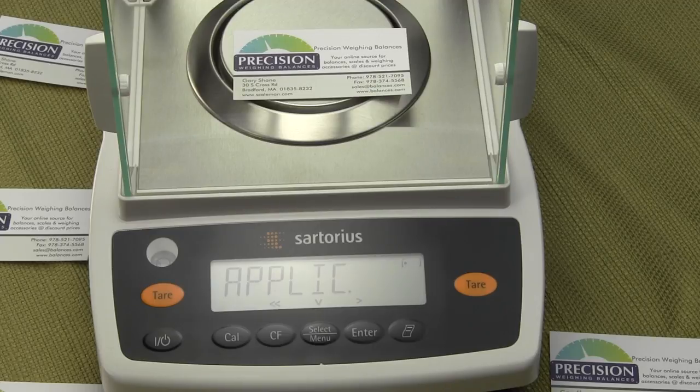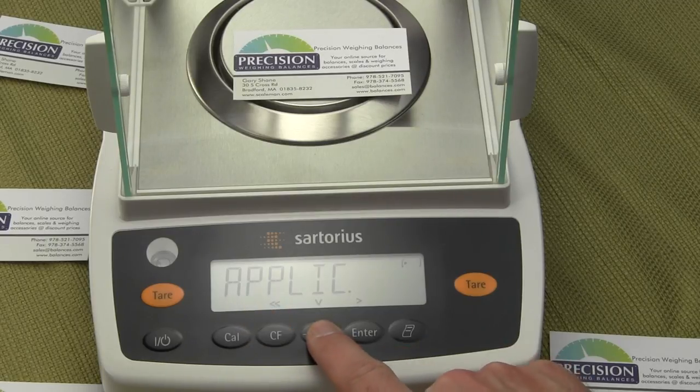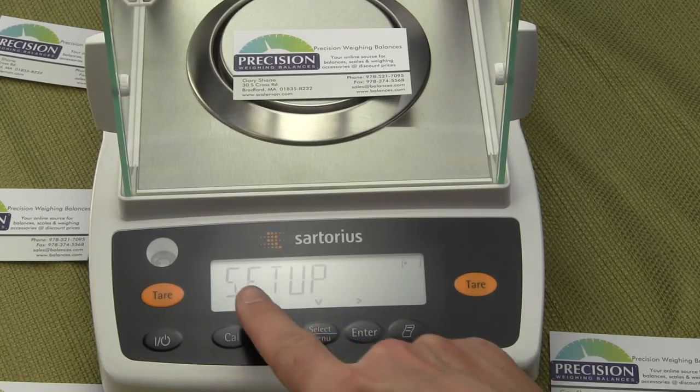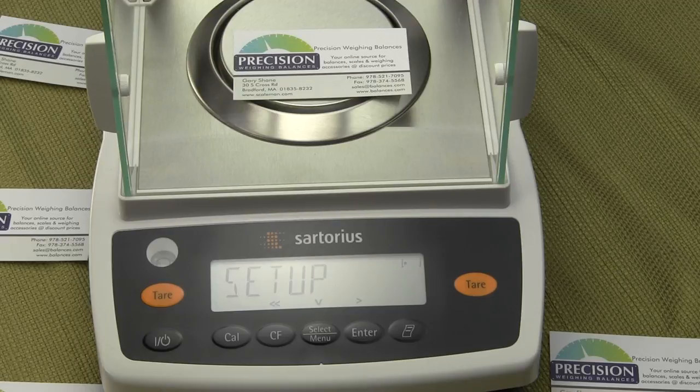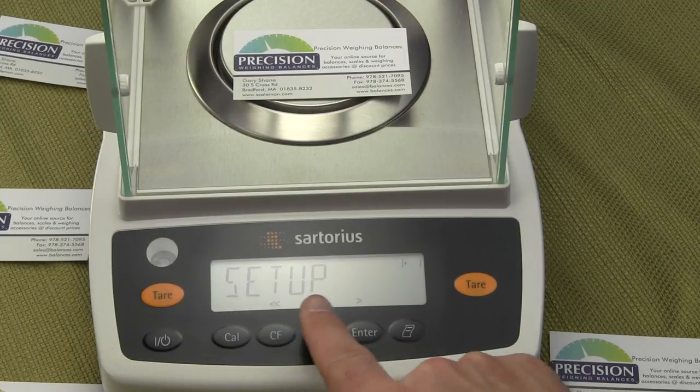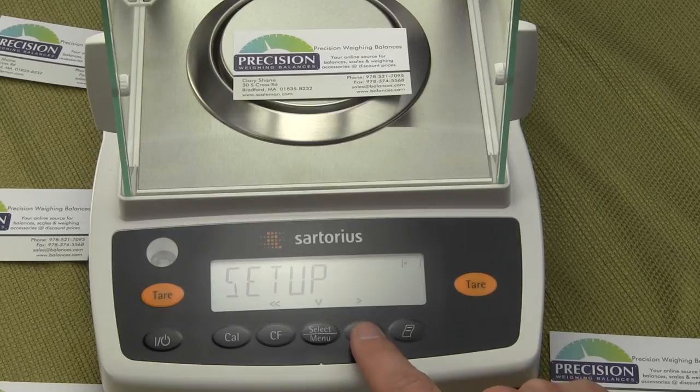You will see the word 'application.' Now press the select menu button four times until you see 'setup.' Press it once — it states 'input.' Press it twice — 'info language.' Now we're at 'setup.' Once you see 'setup' on your screen, press the enter key twice. We're now in the setup function, and pressing enter twice will display the word 'ambient.'